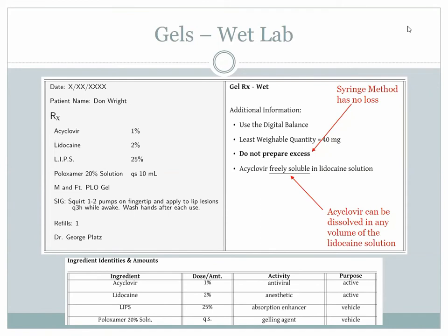All right. Finally, since I know none of you want to have to be here longer than you have to, let's work on these calculations together. I think you're going to find that they're pretty easy, and even the procedure is really quick. So this is not a difficult thing to make, and it's kind of fun to do. So let's do the calculations together. Let's read and interpret it.